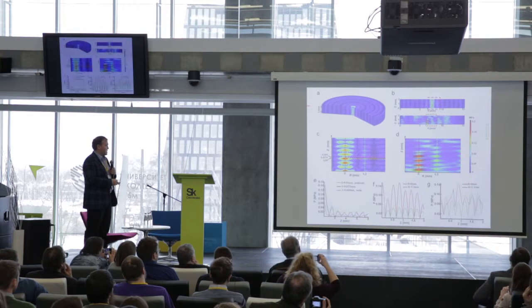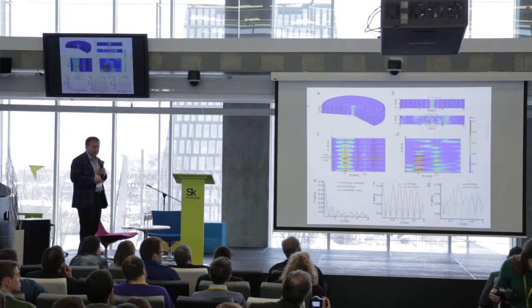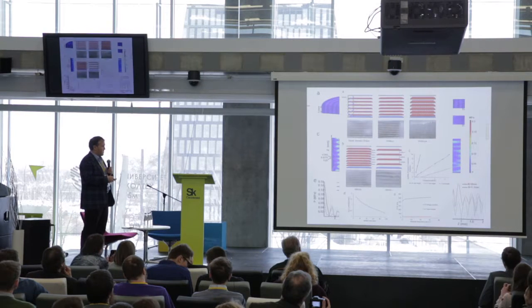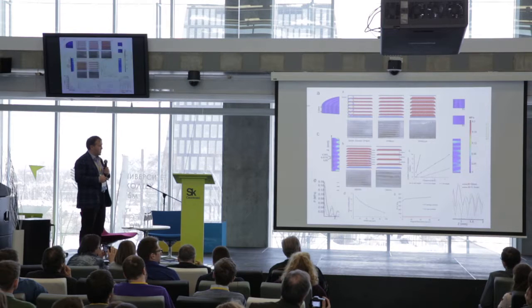And you can see the dependence of waves in Z and in X, you kind of create these plates. And we have some variation in the X direction also, because we are working in the near field acoustics, and it's always going to be different, but it still allows us to assemble cells. We initially started with making layers of beads and controlling very precisely, as a function of the frequency and wavelength, where these layers will be.